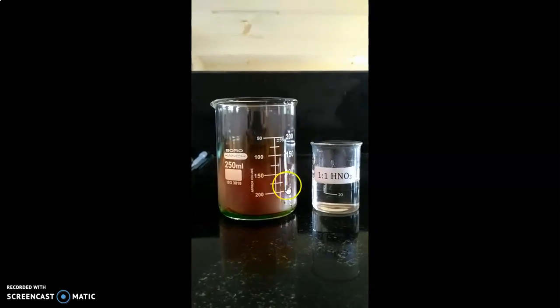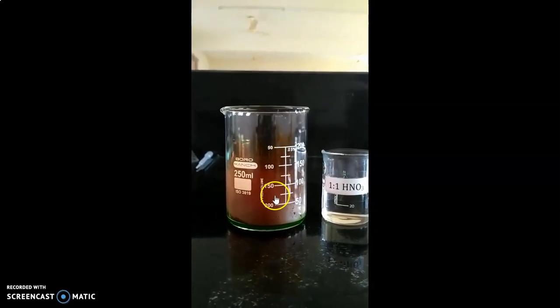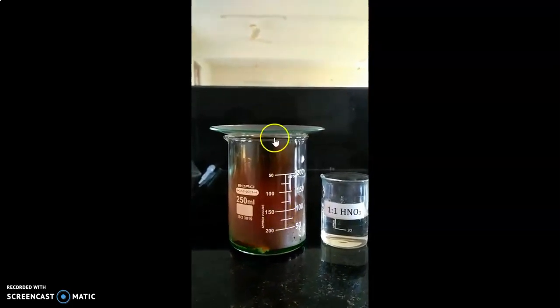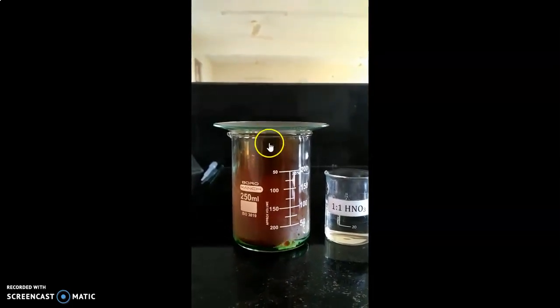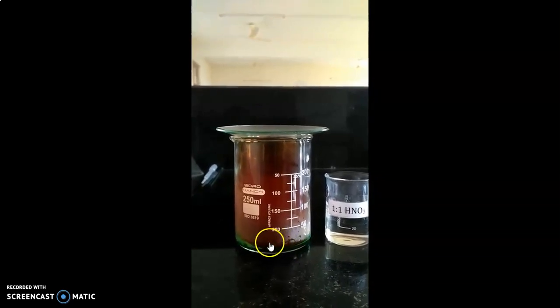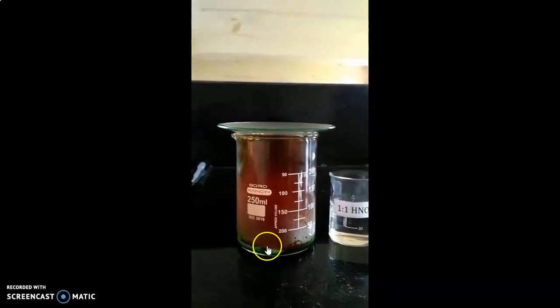After the addition of nitric acid, we can see the brown fumes. It is exothermic, and we have to cover it with the watch glass. We can see the effervescence until all the brass strip dissolves completely.